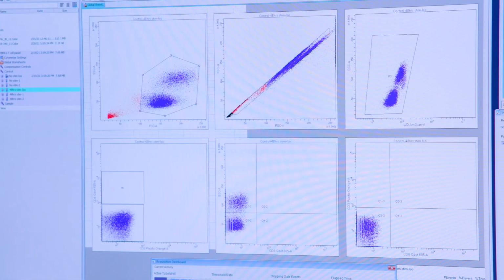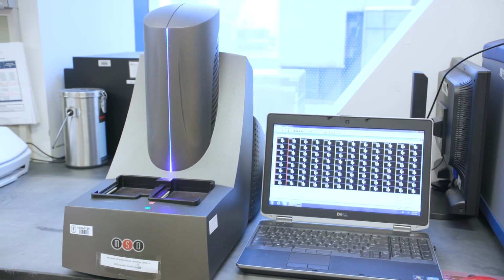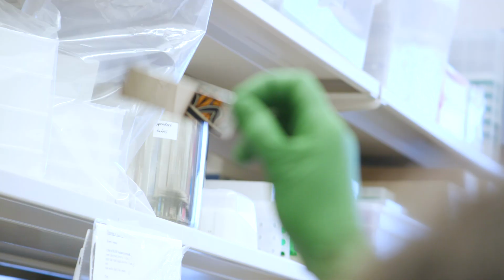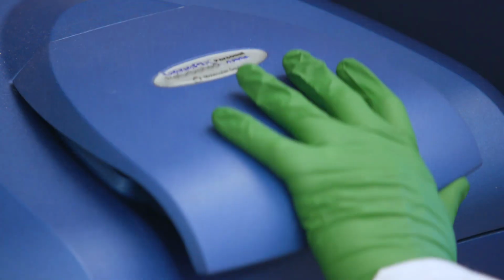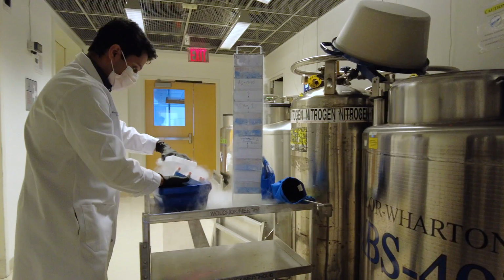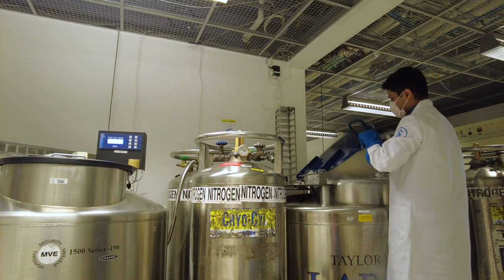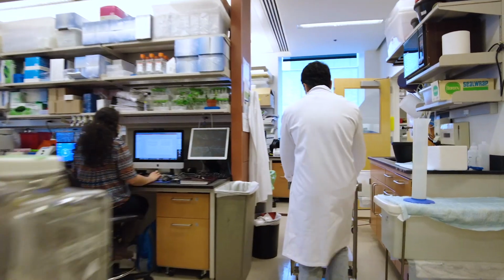including multi-parameter flow cytometry, multiplex cytokine immunoassays, serological assays, and protein microarrays. For a typical flow staining experiment, the lab member working on the project retrieves the relevant samples to be analyzed from the liquid nitrogen freezer and brings them to the lab to prepare them for the assay.